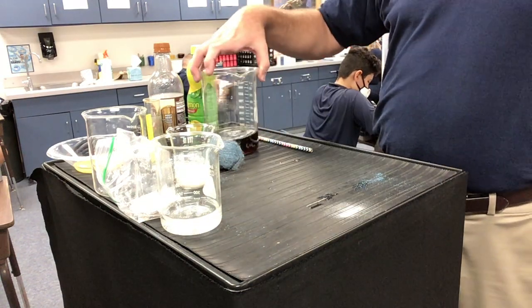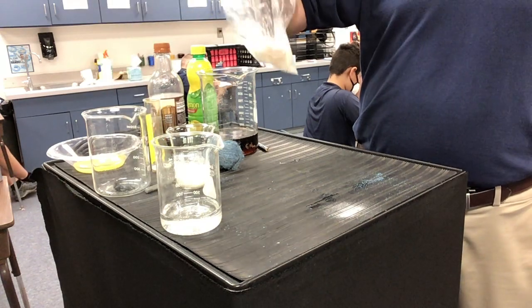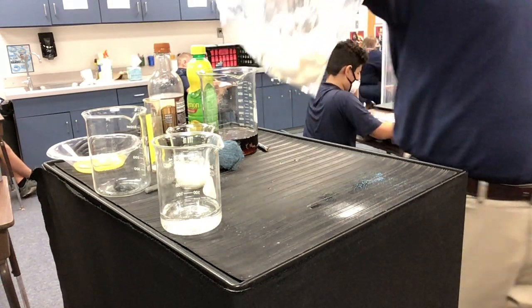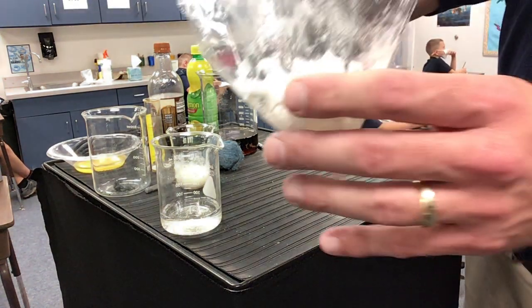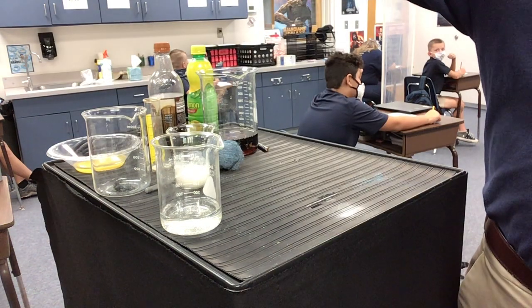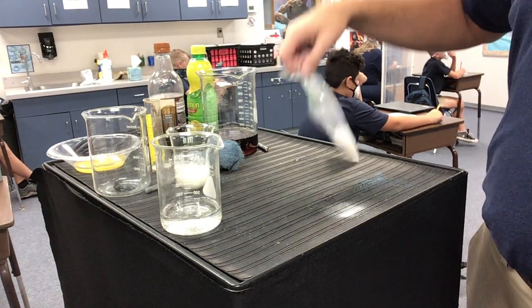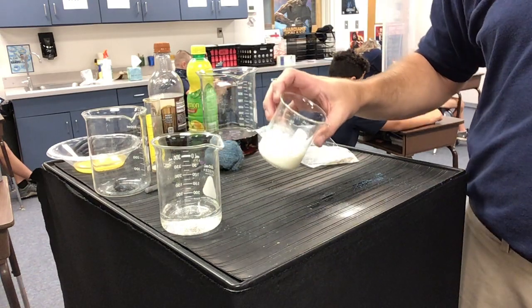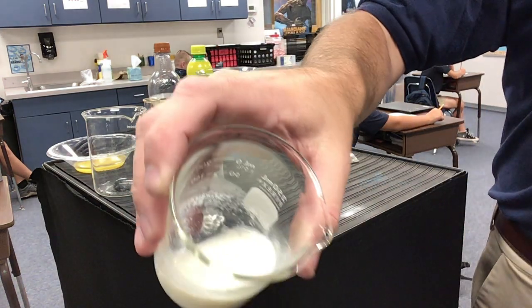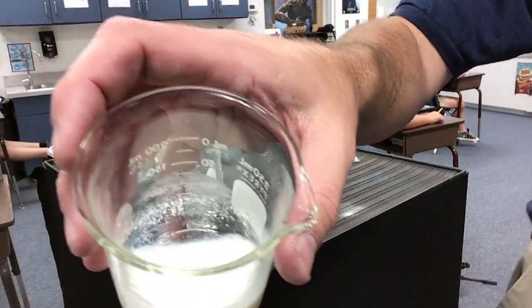And now let me go back to some of the ones we've already done. Okay, this is the eggshell and the vinegar at the beginning. Okay, in case you can't see it, this is what you're looking at. And then the last one was the milk and lemon juice. Give you a good look and see how it's changed since then.